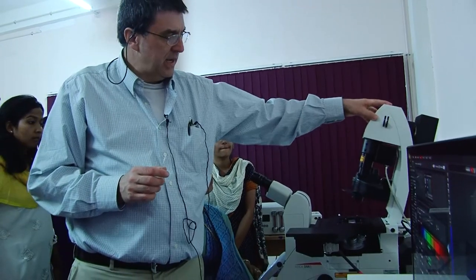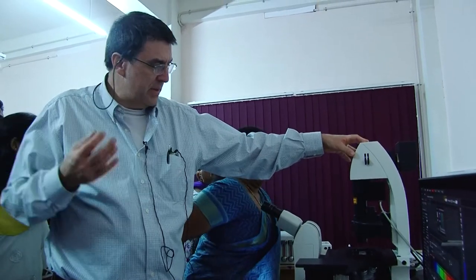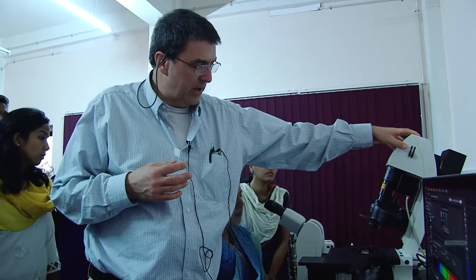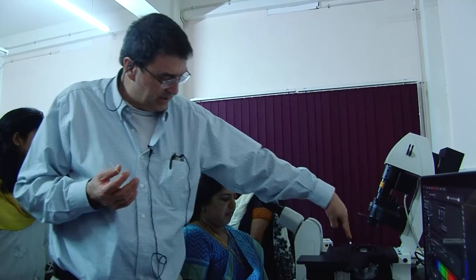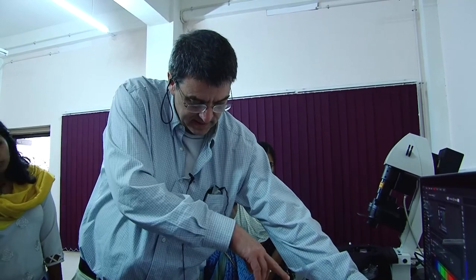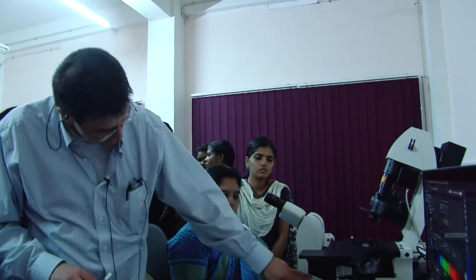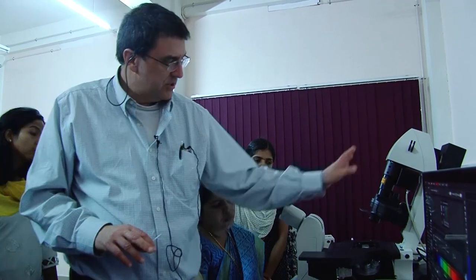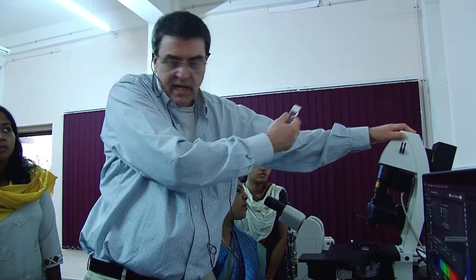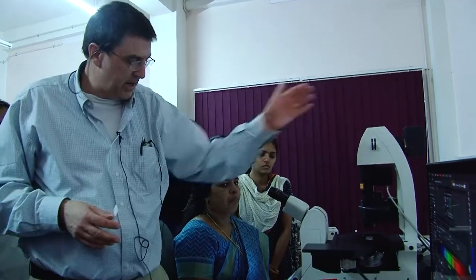On a scope like mine too, this is the white light up here. On my scope, I don't have a laser on my main one, so I can just keep this out of the way if I'm just doing fluorescence. I'm not talking about confocal fluorescence, I'm talking about wide field fluorescence. This is a fluorescent light box right here. Fluorescence is all underneath. Your cubes and such are in here, so you wouldn't even need this. This is your white light. This is your transmitted light. This is your DIC, this is your phase, all that, okay?